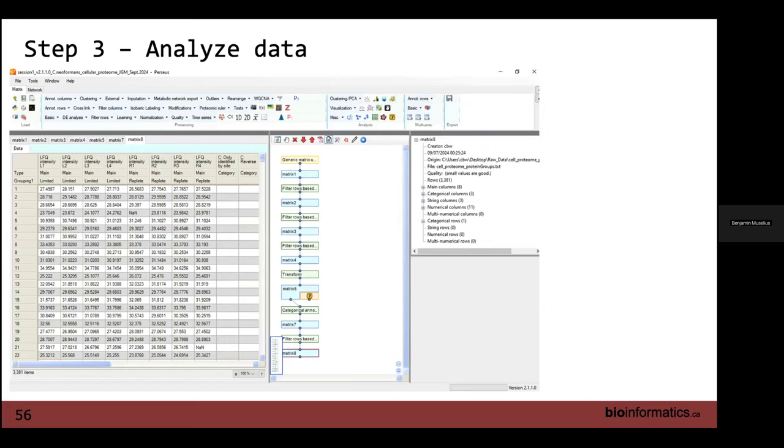Okay, so that's great. So if we think now back to our log transform, in our data set there were some values that are 0. We can't log transform 0. So even though we may not see it in our first, in this case, 22 proteins, there are some values in here that just say NaN, right? Because it was reported as an intensity of 0. We performed a log transform, it did it and said, well, can't do that. That's not a number. It's now a NaN. So this goes back to imputation that we were talking about.